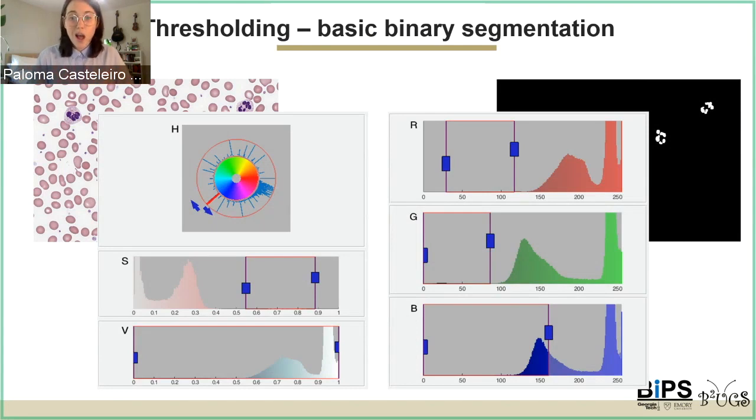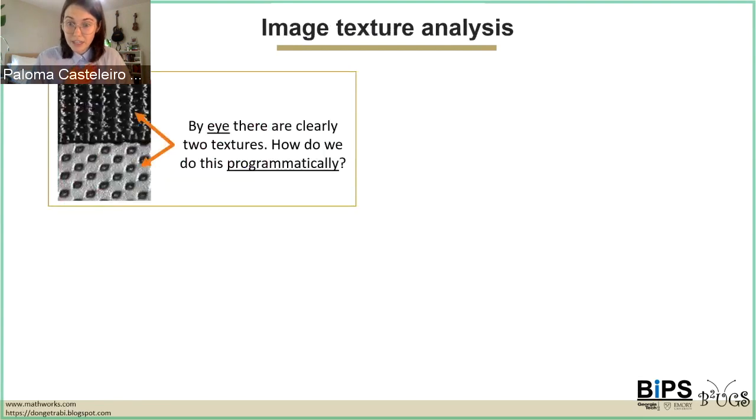For example, I do quantitative phase imaging, and we rely on a grayscale image, but it's hard to tell the foreground from the background. A lot of the time, the whole image is tissue, and the only way to differentiate between different sorts of tissue is by looking at the texture of the tissue. So let's talk a little bit about texture analysis and some basic concepts, and why it's useful.